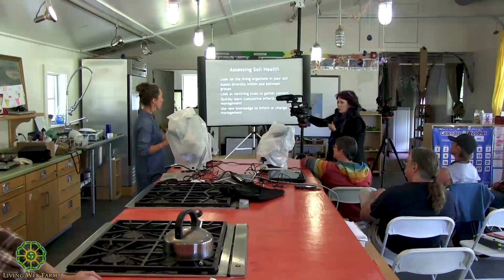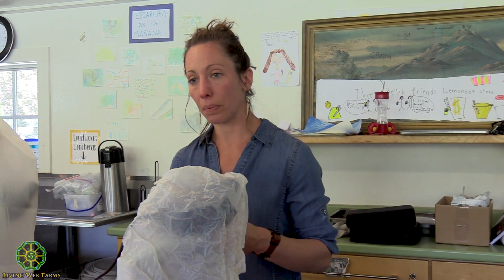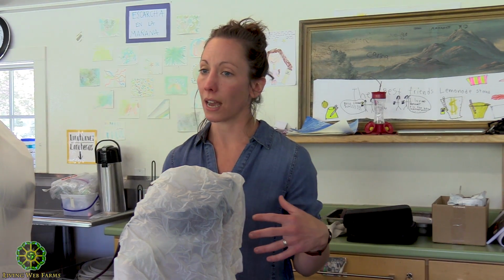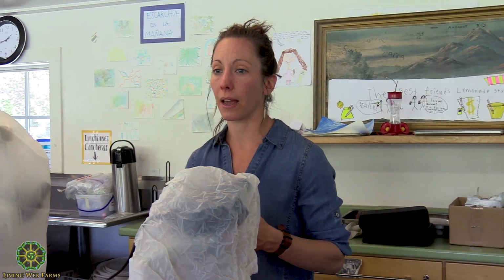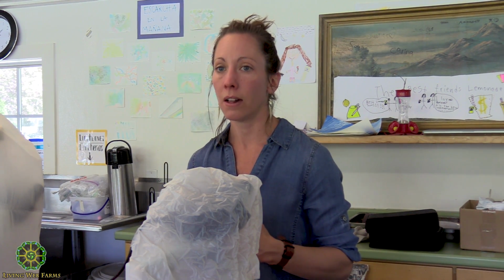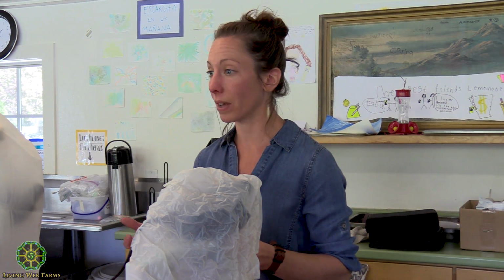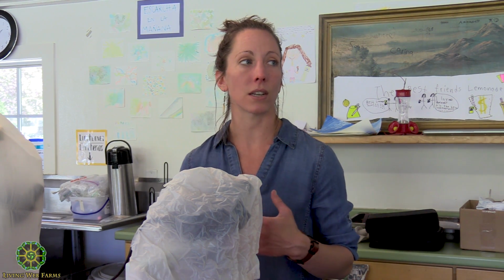We'll go through a quick PowerPoint. We'll talk about the different taxonomic groups in the soil that you might see under the scope. And I'll do a couple sample slides. We'll look at some samples together. Then we're gonna take a break until about 4, then we'll do breakout groups, and we'll have a good amount of time to do that. It'll be really free form, should be fun. At 6, Pat has prepared a meal, so we'll come together, we'll eat, and then hopefully once everybody gets their food, we'll get to share what we've seen and discuss that.